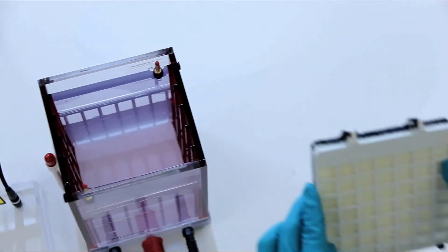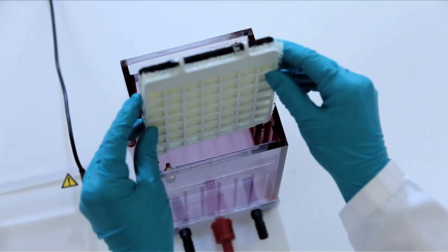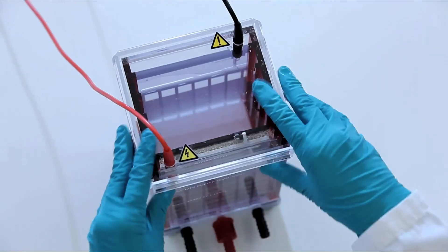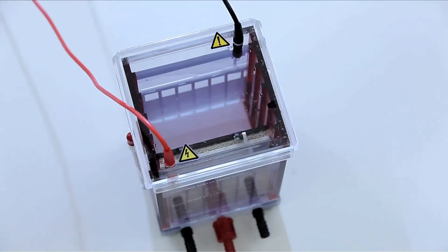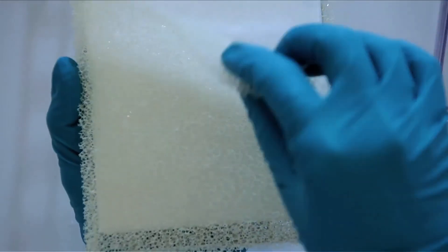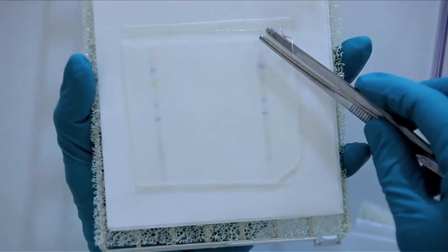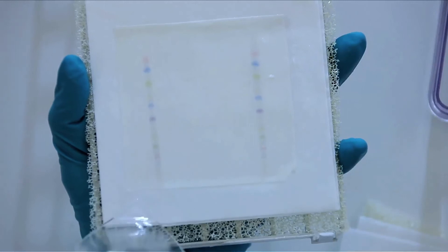Place the sandwich in the transfer tank. To avoid errors, always orientate the sandwich with the anode towards you. Transfer the proteins to the membrane with the desired voltage. Confirm the transfer by looking at transferred rainbow markers on the membrane. If it looks like this, you are doing well.